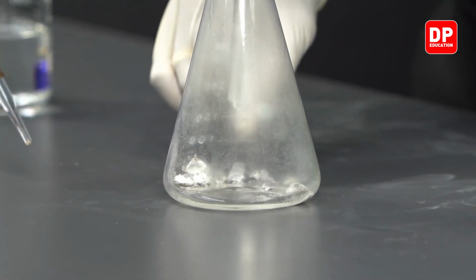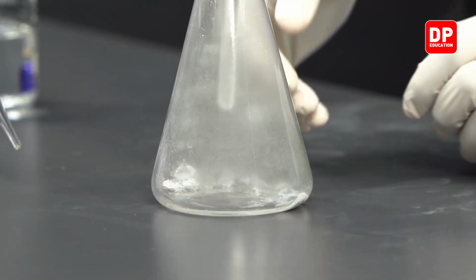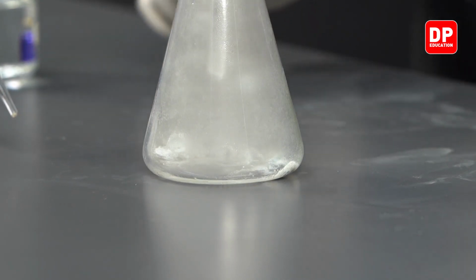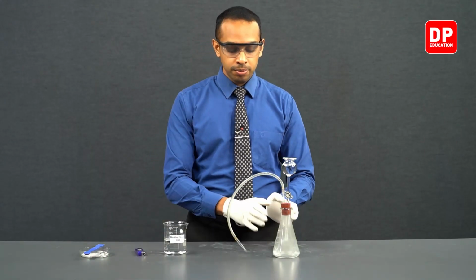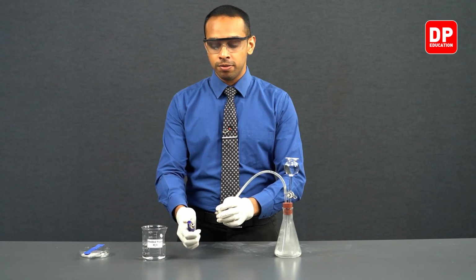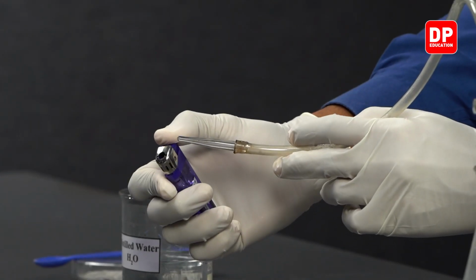As you can see, when water is added to calcium carbide, we can see acetylene gas is produced. After producing the acetylene gas, we are going to take the open end of the delivery tube and observe if we can light this open end of the delivery tube.